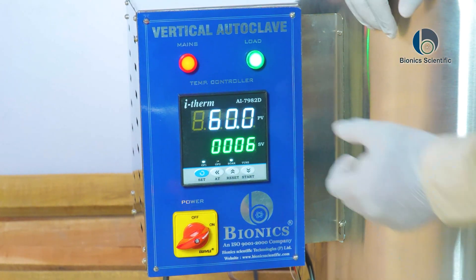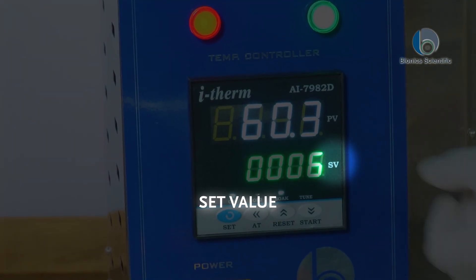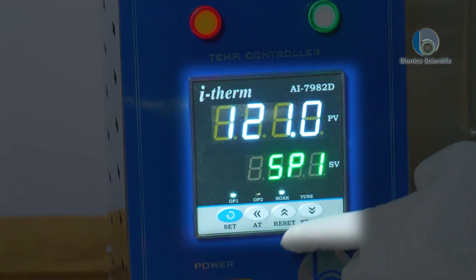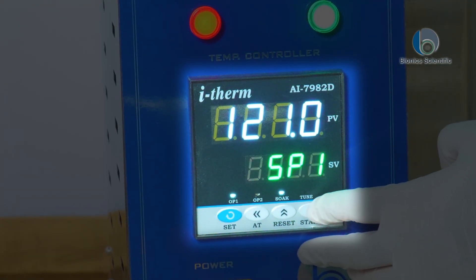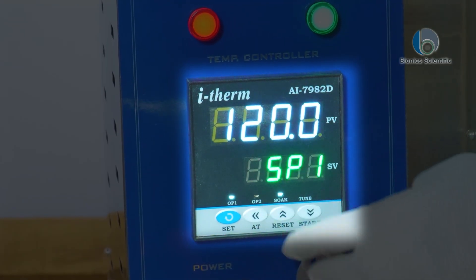This is our PV and this is SV. PV stands for present value, SV stands for set value. Here you can see the temperature is set to 121 — that is SP1, which is one cycle. If I want to change it, I can set it from 121 to, say, 120.